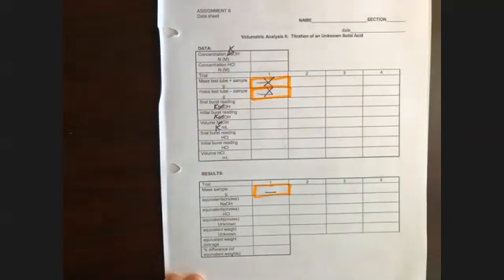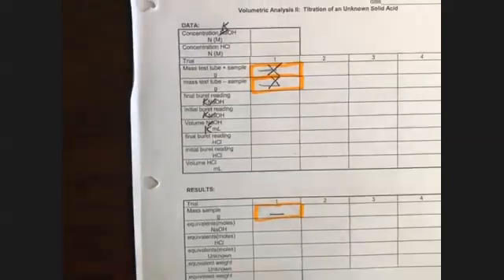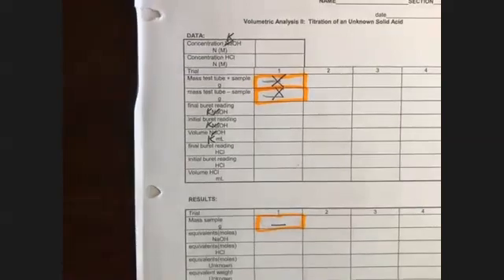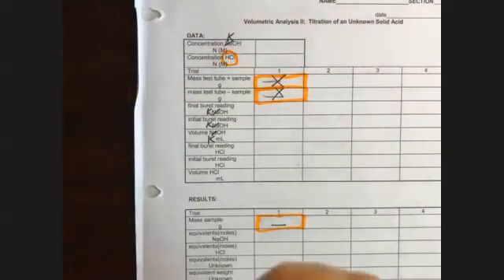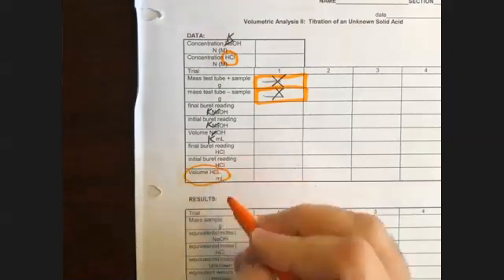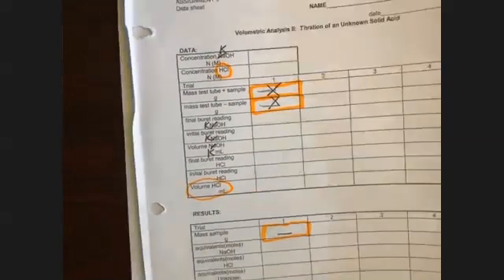Now, you probably noticed something in here, and it is that they're putting in here HCl and a volume of HCl that was delivered. What is that all about? Well, let me explain to you what that is about.